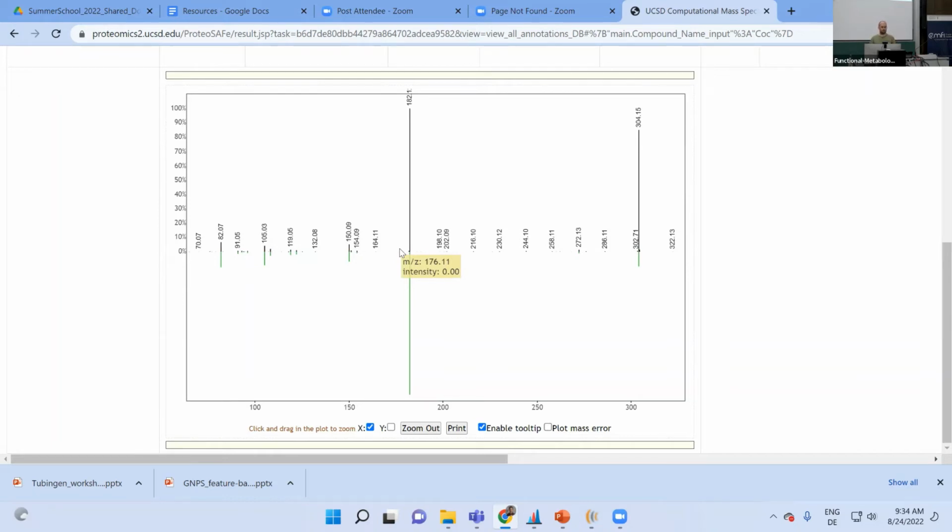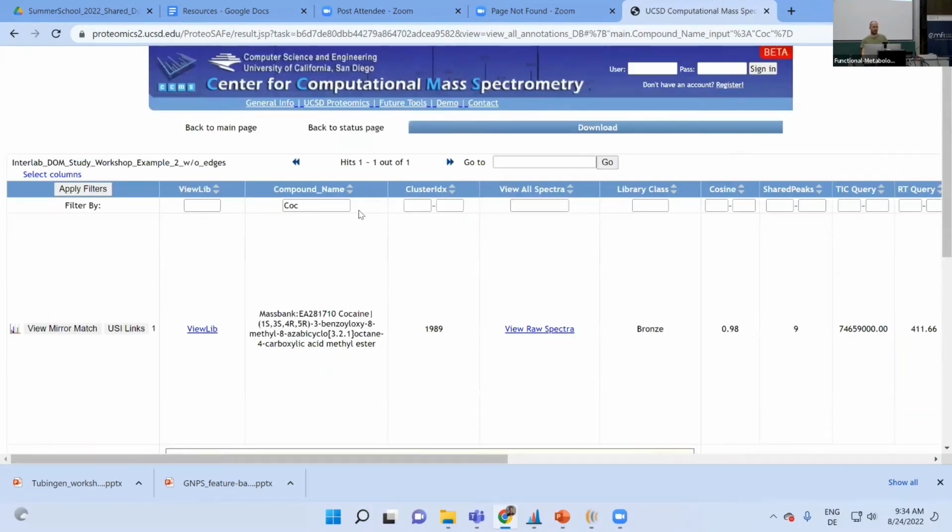Question? So I have two hits for cocaine. Yeah. But I see some different numbers, but I don't see a different structure. Why is that? Yeah, so that could be exactly that type of artifact I mentioned before. If the cocaine peak on MS1 level was really big or had a long tail and some spikes, maybe the feature finding has split it in two.